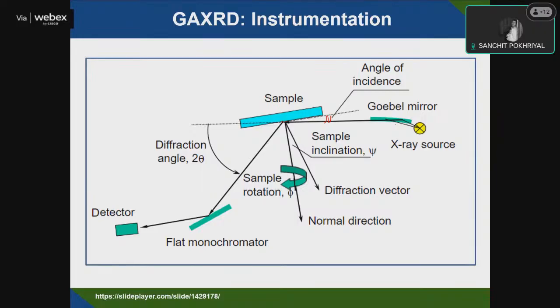If we denote the axes by x, y, and z, and let's say the crystal is lying in the YZ plane, theta is rotation about the z axis. That is the detector rotation, the 2 theta, sample to detector, and source to sample, that is your omega. So the angle of incidence will not be the same as the angle of diffraction.